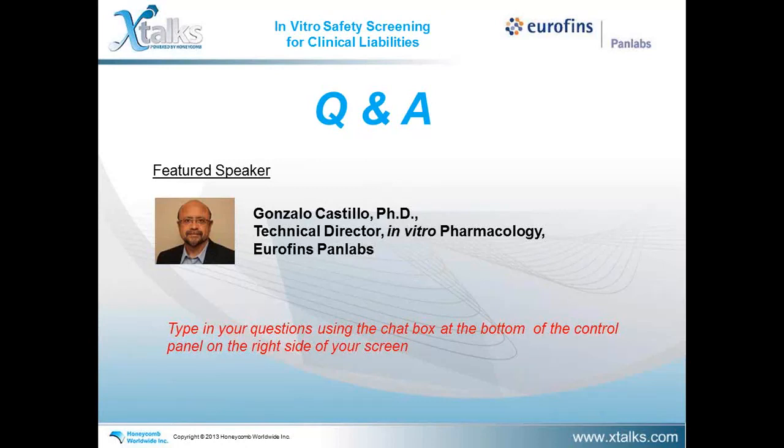Right. Okay. Thank you. Our next question here: how was the SafetyScreen validated in terms of its ability to predict clinical effects?